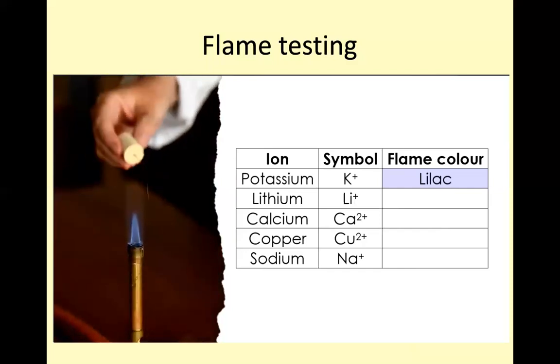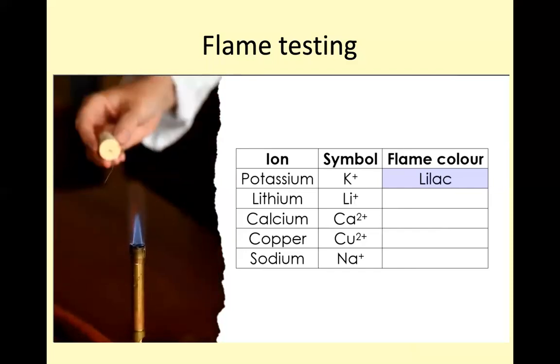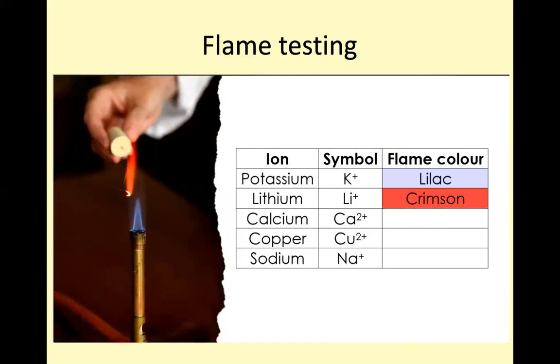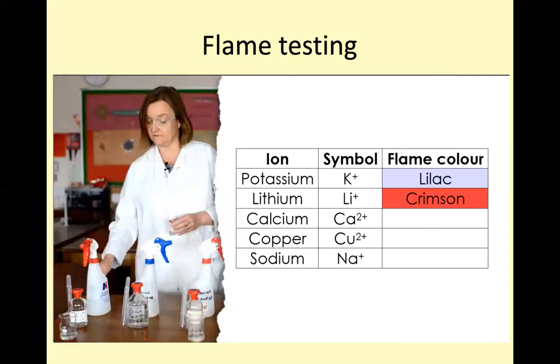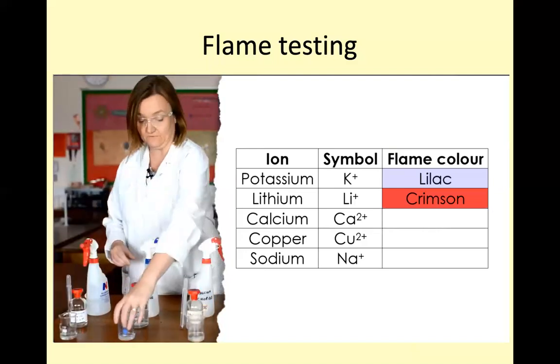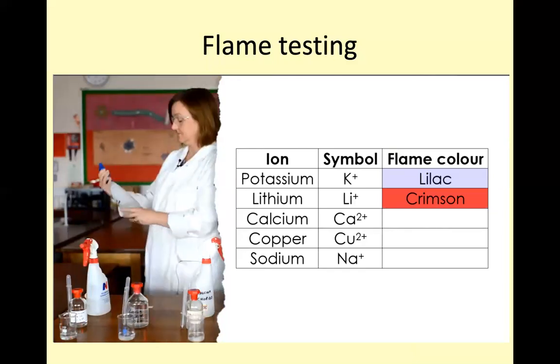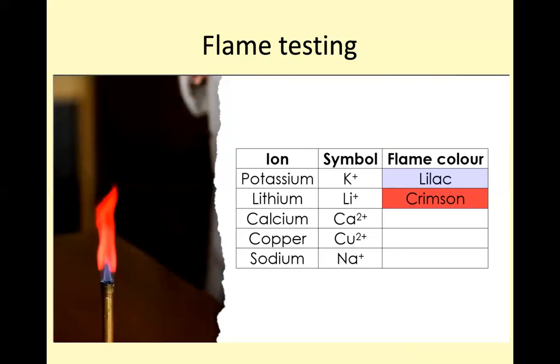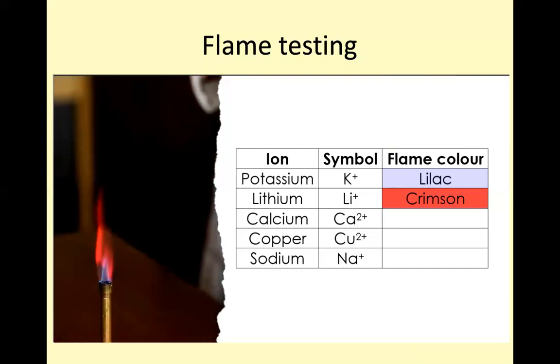There, do you see that really dark red colour? Usually described as crimson, this is very characteristic of lithium. Again, let's try the spray bottle and see if we can see that colour again. So, lithium. Beautiful dark red, crimson colour.